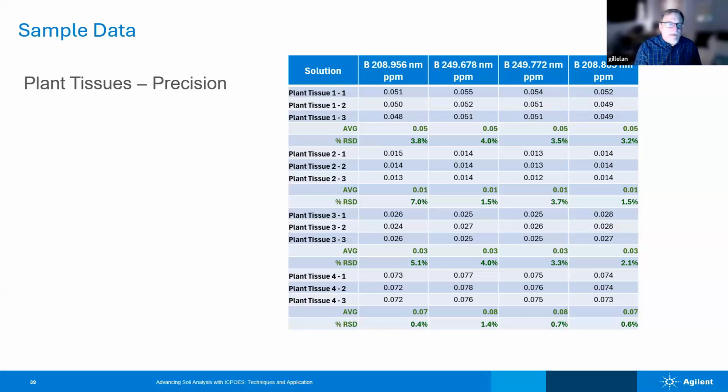Tensioning a peristaltic pump is a delicate thing that needs to be done properly, and then it really shouldn't have to be done again for that size tubing. There are a lot of people who come in and want to crank the tension, and it wrecks the tubing and makes all subsequent tubing last a shorter time.